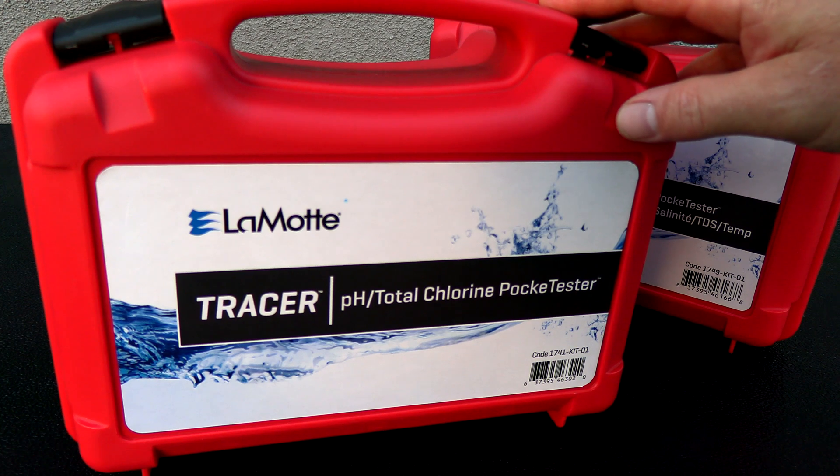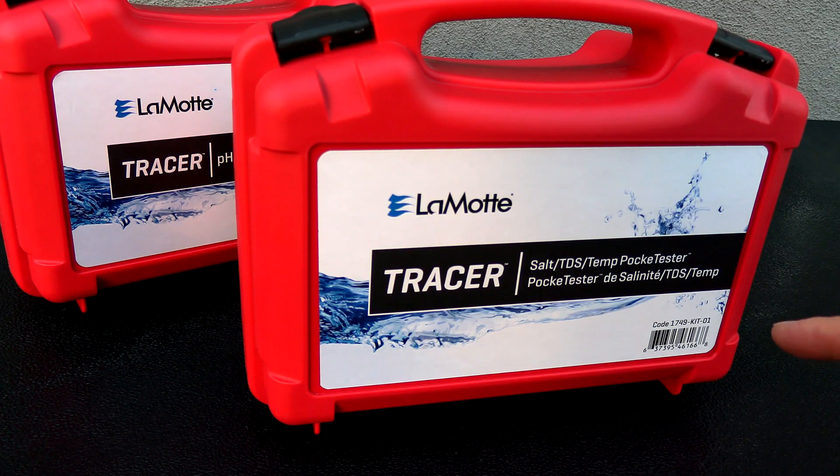In this film, I'm showing you the Lamont Tracer Pocket Tester for PH and Total Chlorine. In a separate video, I'll be going over the Pocket Tester Salt and TDS for you.